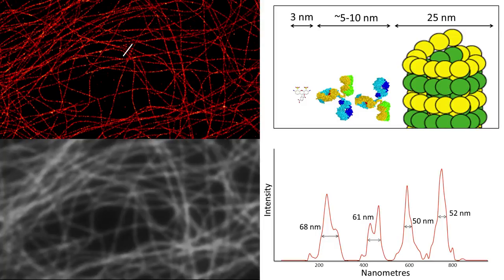And one of the big advantages about imaging a known structure such as microtubules is that you can use it to benchmark your microscope and to see how it and your sample are performing. To see how much the resolution is improved we can take the same cross section from the epifluorescence image and see directly that the microtubules we are resolving in the super res image are completely obscured within the diffraction limit.